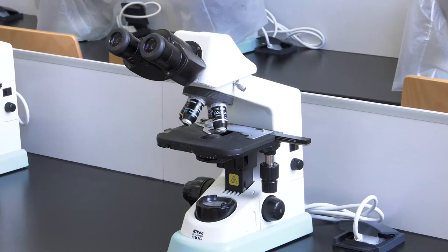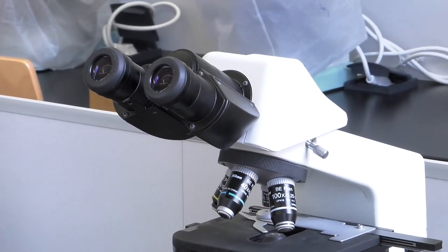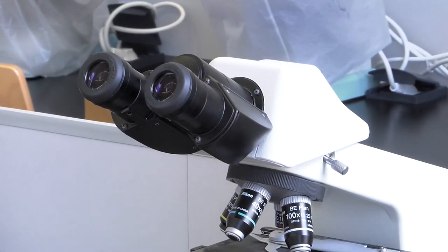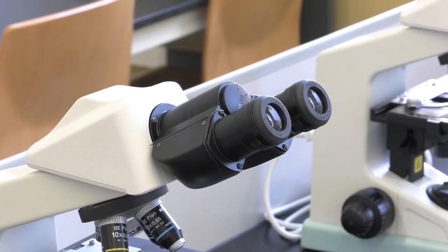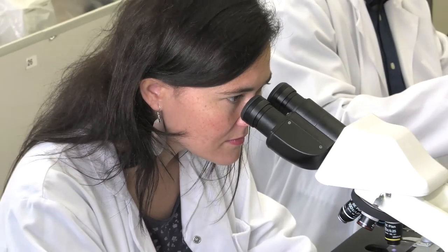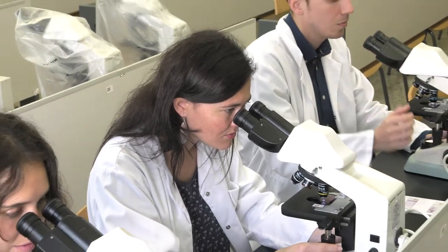The last structural element of the microscope is the head. It includes one or two eyepieces, articulated in an eyepiece tube, depending on whether the microscope is monocular or binocular.